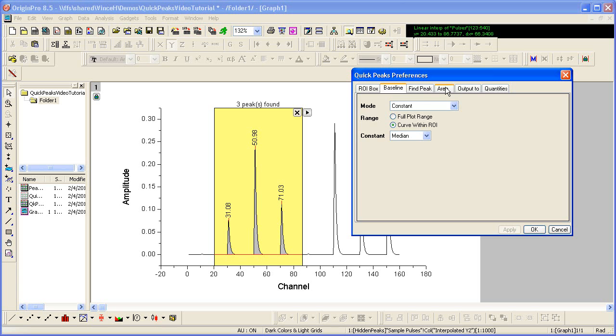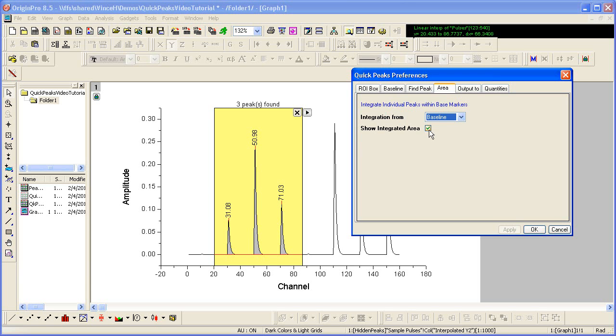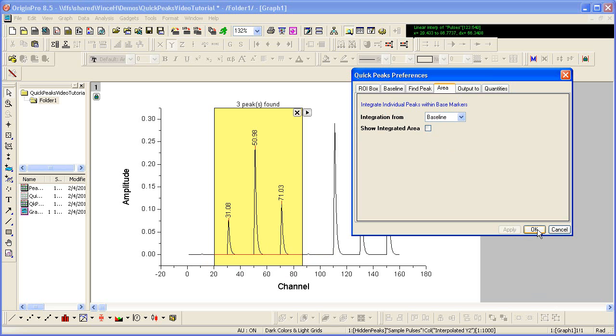I would also like to change so that the area is not shaded gray like it is currently. So I uncheck the Show Integrated Area box and again click Apply. And the shading goes away. I can click OK to save these changes and go back to the graph.